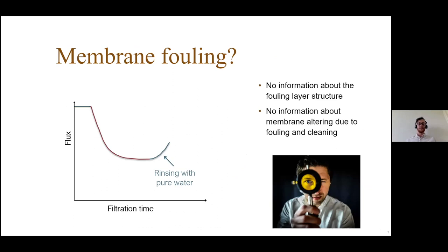This can be compensated by rinsing the membrane and washing away loosely attached compounds. This is reversible fouling that is removed. But there's still a difference between the flux at the end of rinsing and at the beginning of filtration. This is due to irreversible fouling - fouling that can only be removed by cleaning if at all. The problem is there's no information about the fouling layer structure and no information about the membrane altering due to fouling or cleaning.